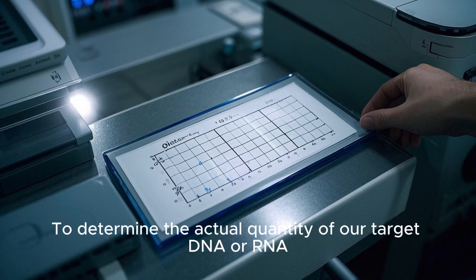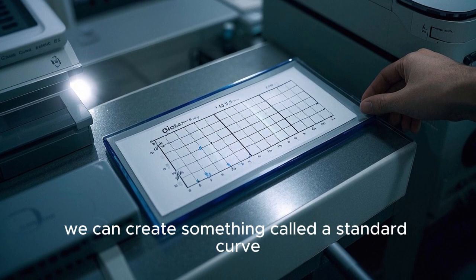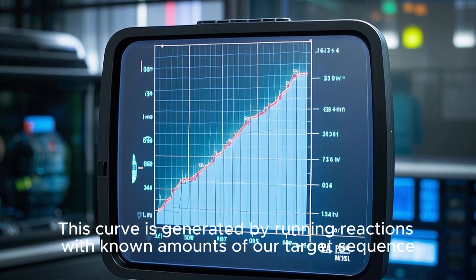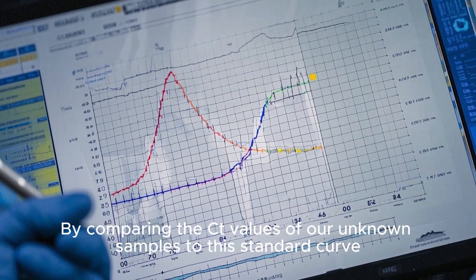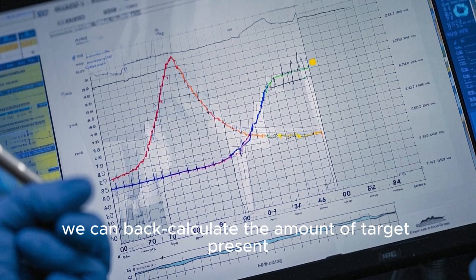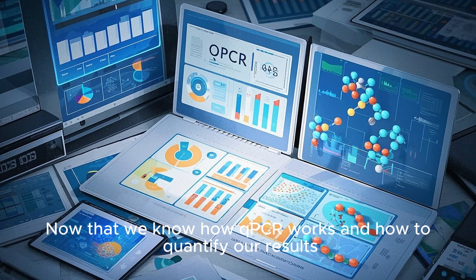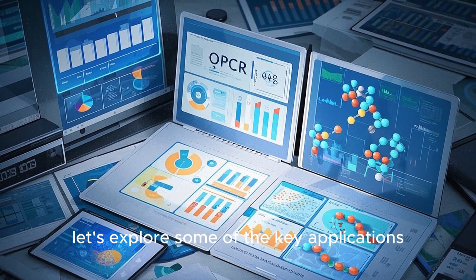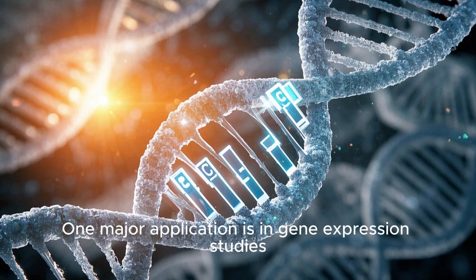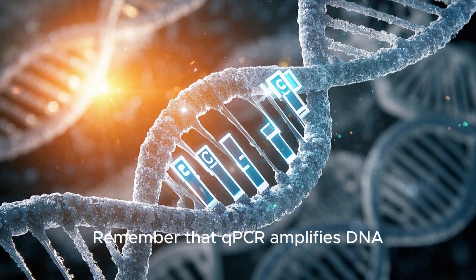To determine the actual quantity of our target DNA or RNA, we can create something called a standard curve. This curve is generated by running reactions with known amounts of our target sequence. By comparing the CT values of our unknown samples to this standard curve, we can back-calculate the amount of target present. Now that we know how qPCR works and how to quantify our results, let's explore some of the key applications. One major application is in gene expression studies, particularly with RT-qPCR. Remember that qPCR amplifies DNA.